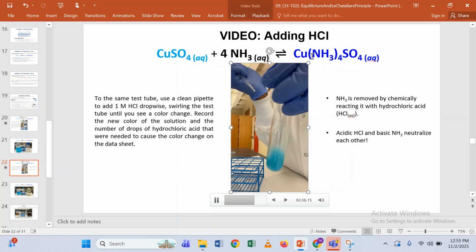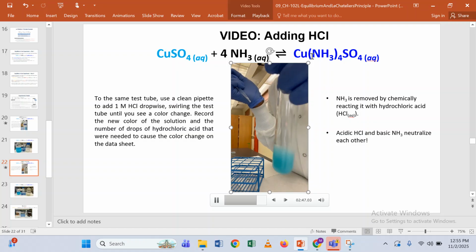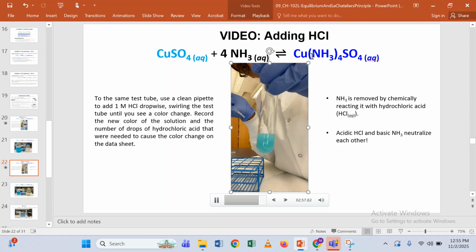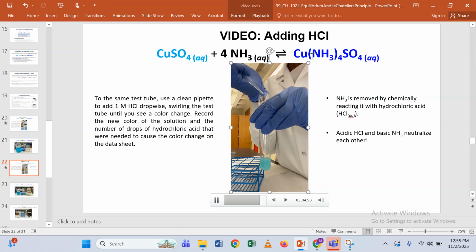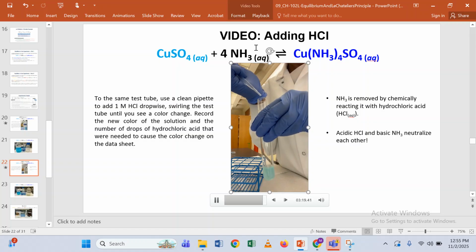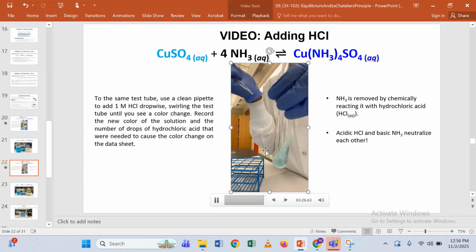25, 26, 27, 28, 29, 30, 31, 32, 33, 34. Look at that. 35, 36.